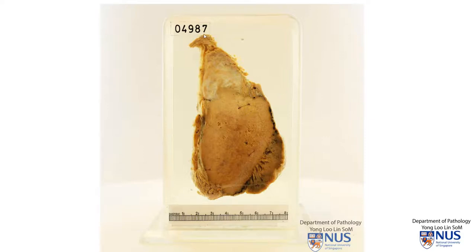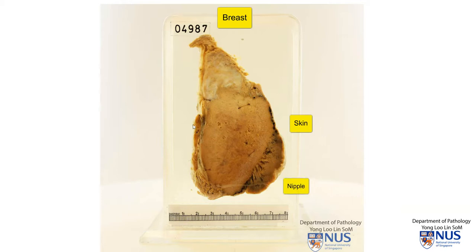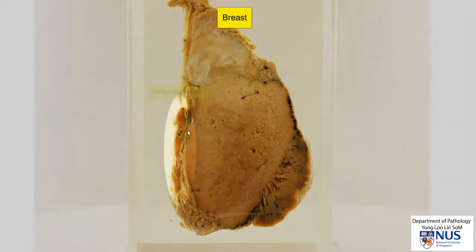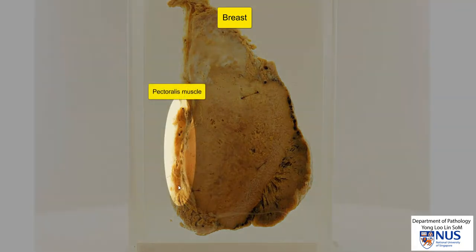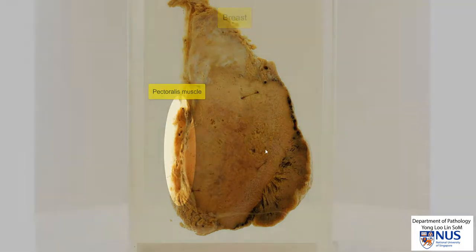Hello, this is a specimen of a breast and we're looking at the cut surface. Let me orientate you. Here is the actual breast parenchyma. Overlying this is the skin and this is the region of the nipple. It is very abnormal here. And deep to this there's a little bit of brownish area which is the pectoralis muscle.